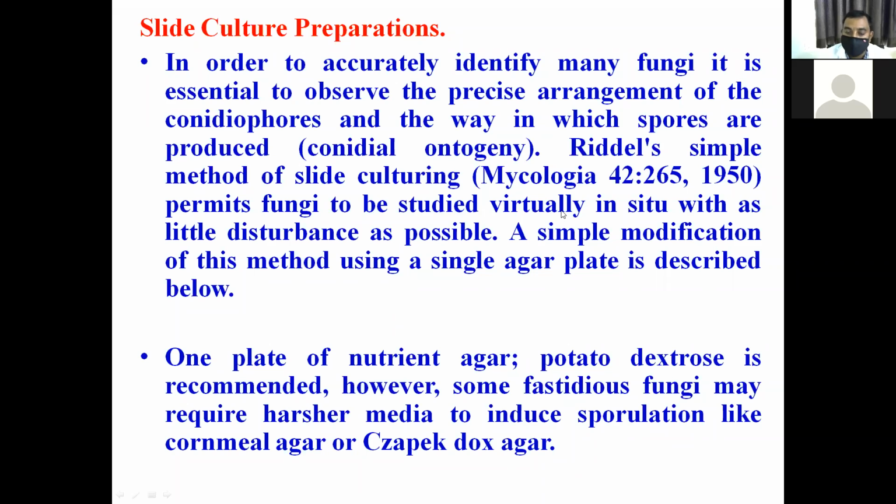In routine examination with LPCB, if you separate the culture with teasing needles, it happens to be separated. Then the culture may be directly examined under the microscope, but a little disturbance will be seen.